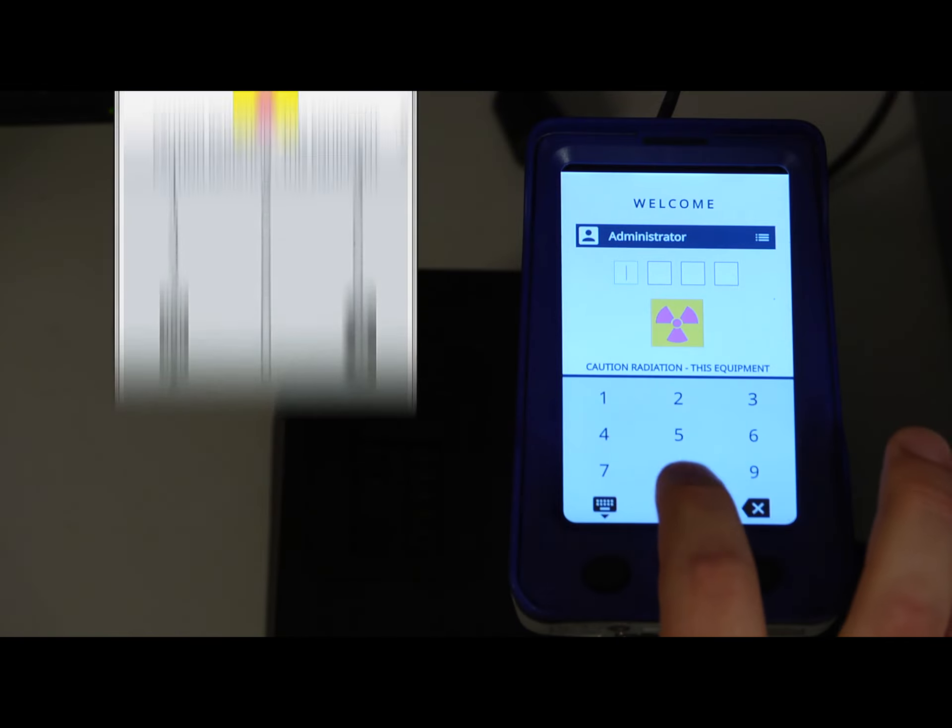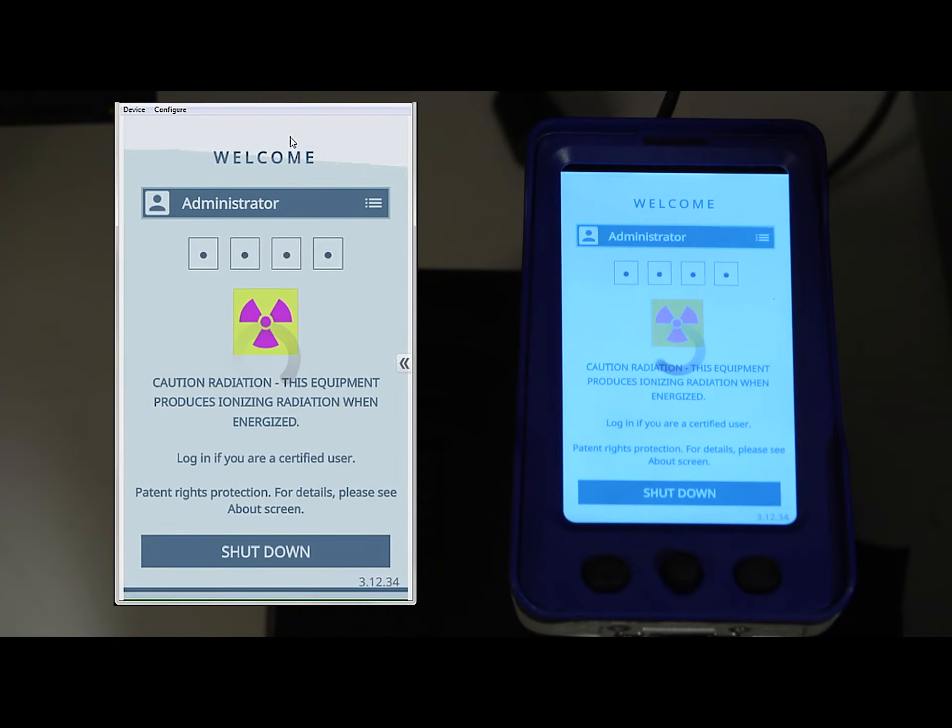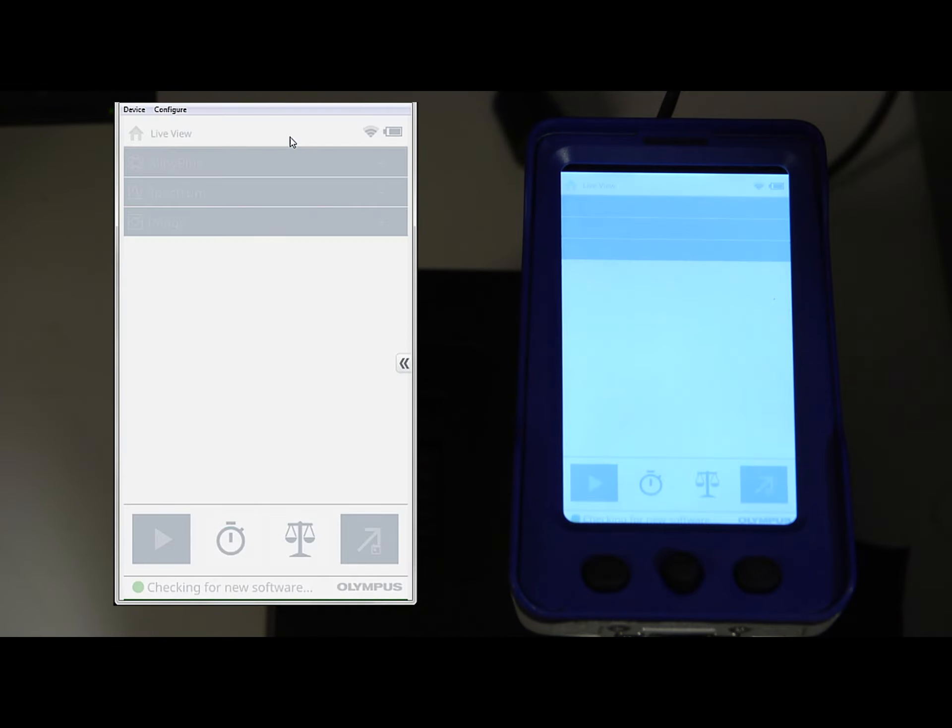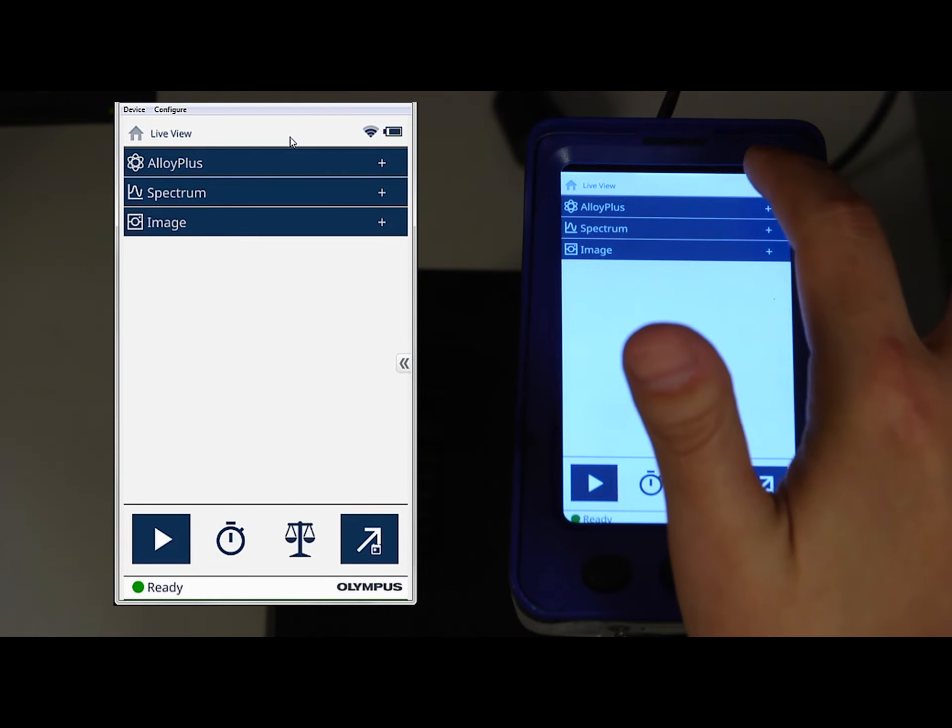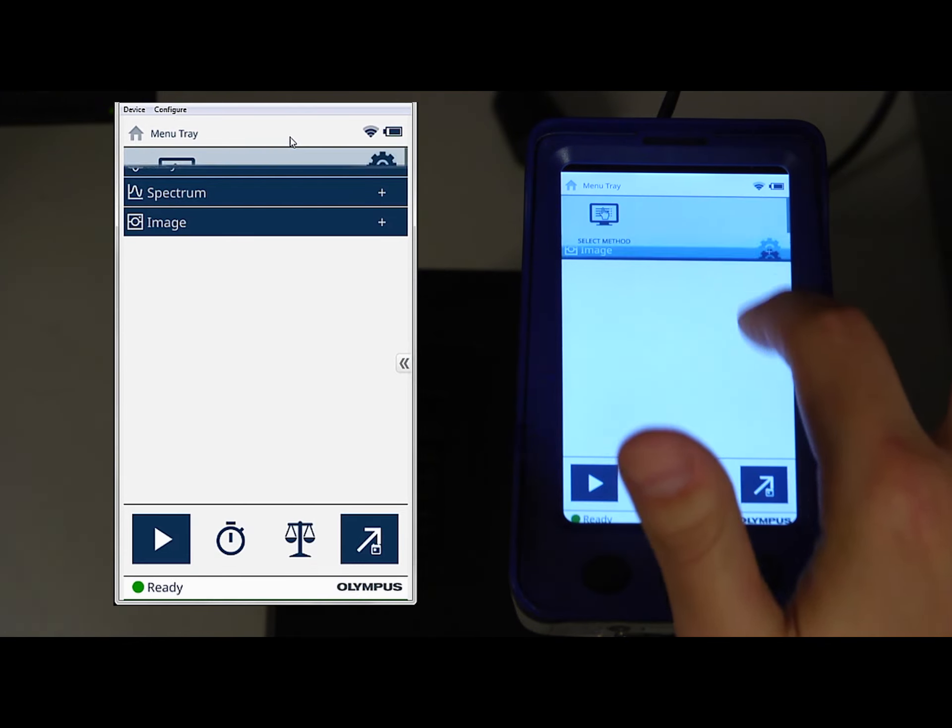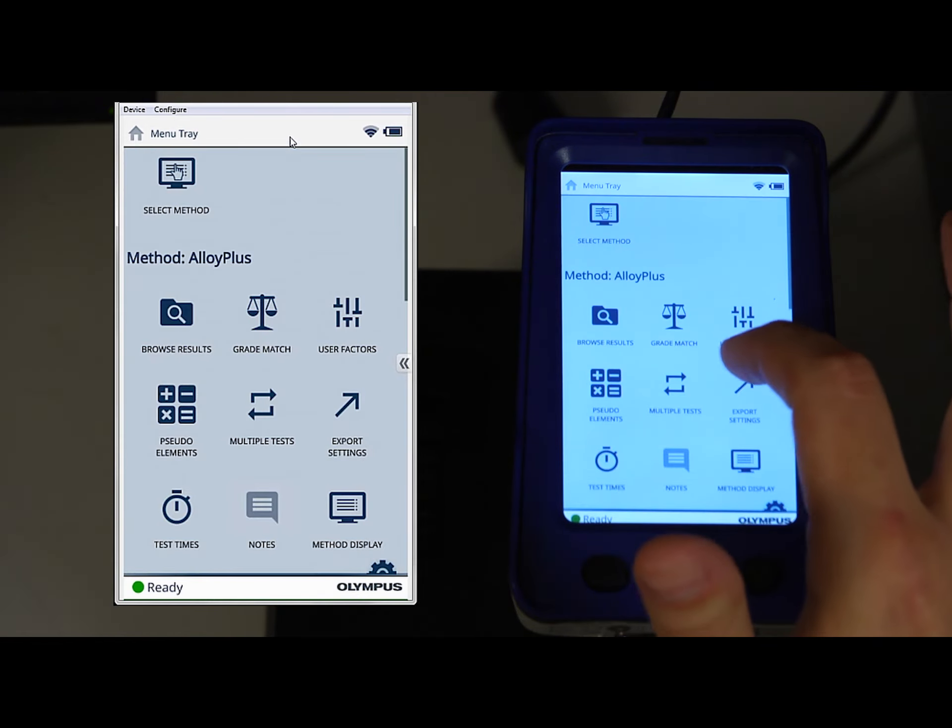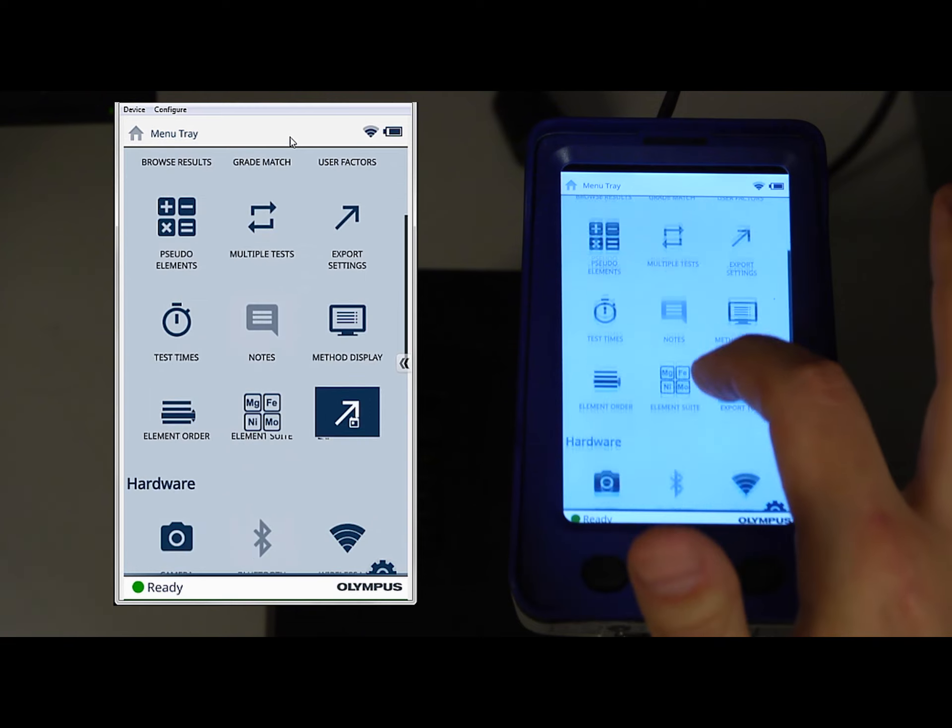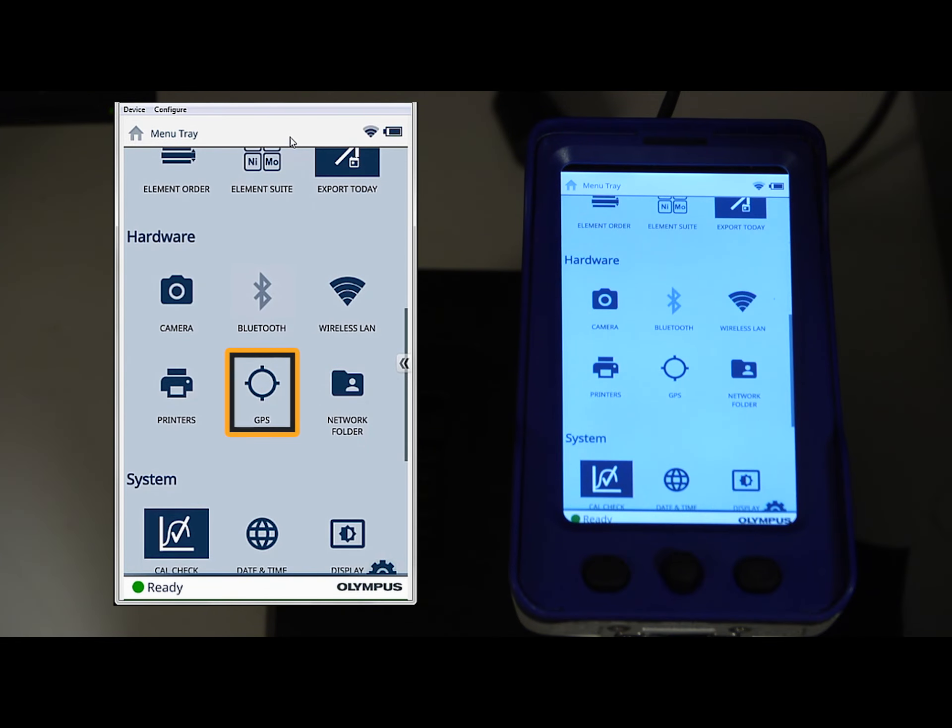To access the GPS, first log into your Vanta. Swipe down from the upper right-hand corner of your screen to open the menu tray. Scroll down the menu tray until you reach the hardware section.